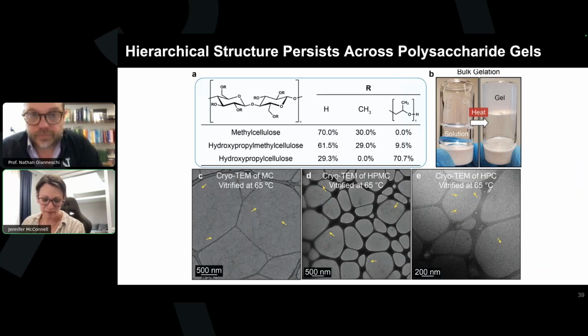But with the fibrillar hydrogels, fibrillar, okay, that one. What does the damage look like? Because you know you're avoiding damage. How do you know what the damage looks like for these different materials when you're trying to figure out where that benchmark is for your dose?